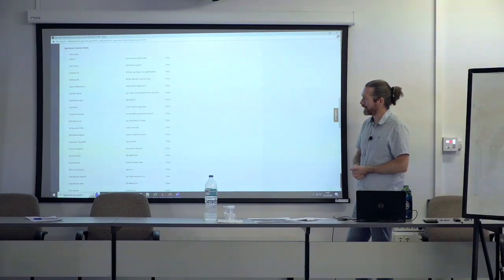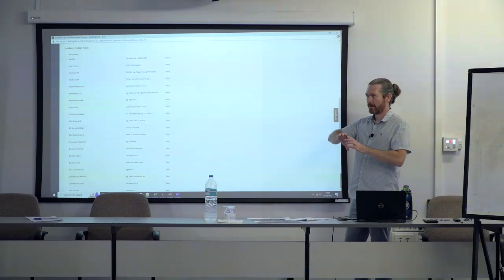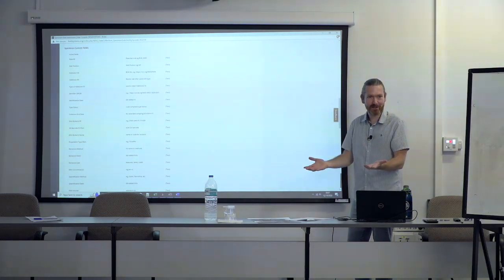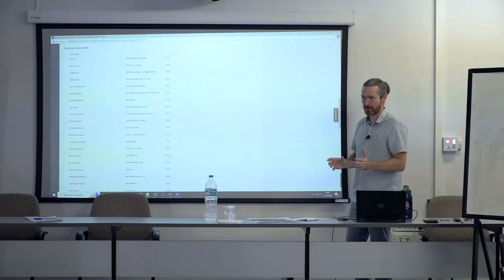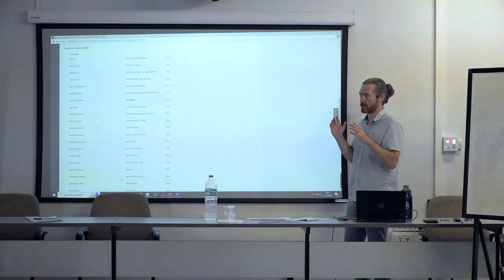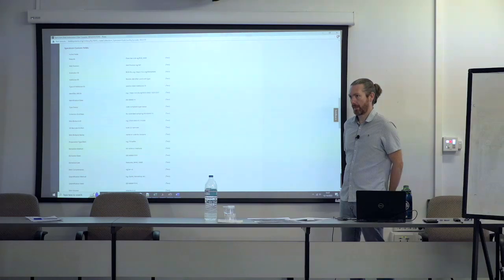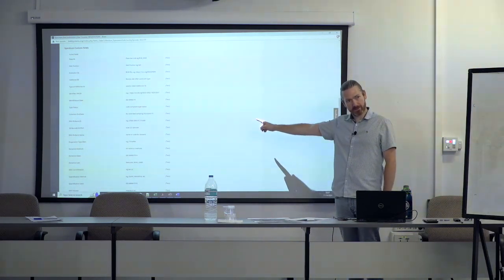We're kind of using the workbench as a database for the entire project, which is not what it was designed for. But rather than a LIMS system across multiple sequencing facilities and all those sorts of things, we just thought, well, the records are going to go into BOLD, so let's just try and keep as much of the data with those records in BOLD. But then for that, we need this custom data to be publicly visible, which it isn't, or at least not via the API or something.